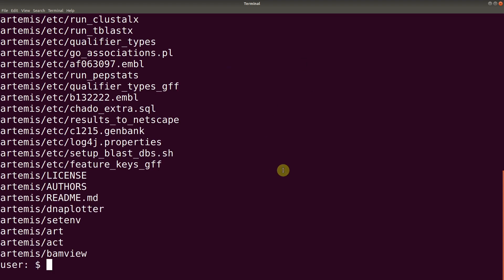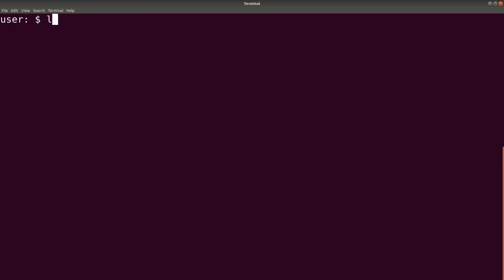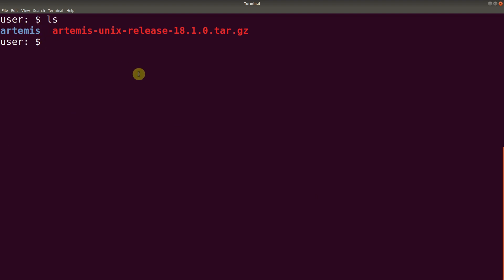So extraction is now successful. Let's clear the screen first. So if we do an ls again, you'll find that a directory has been created. This contains the binary files that we've run.